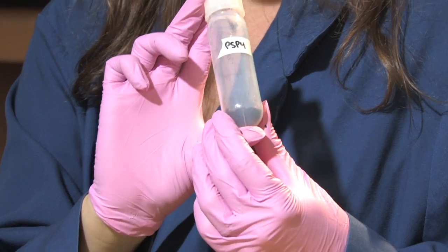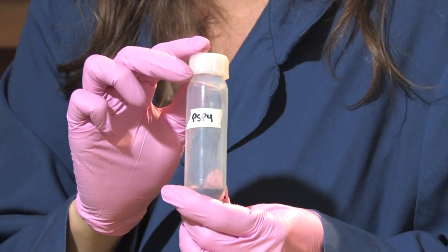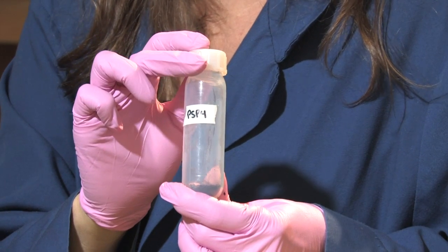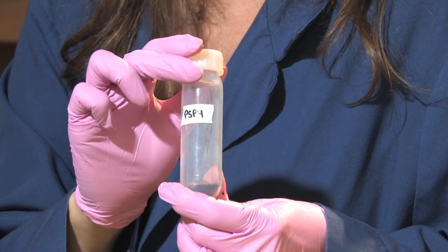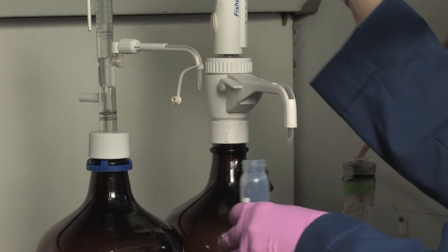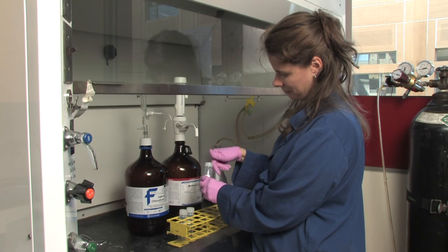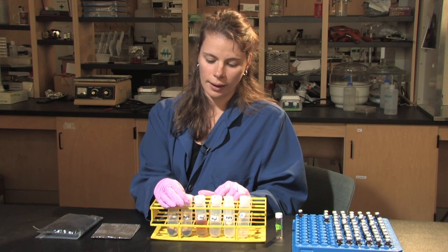I begin the process by weighing out the soil into Teflon tubes. These Teflon tubes are safe with solvents, which will be used quite frequently throughout the procedure. Once the soil is weighed, various solvents — including chloroform, methanol, as well as citrate buffer — are added to the soil. This lyses the cells and extracts the phospholipids from the cells within the soil.